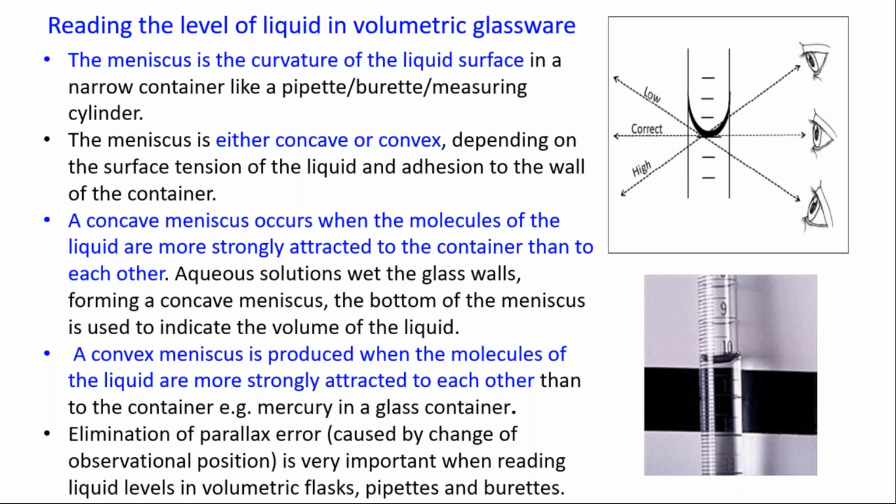Very often when the liquid is there, it is very difficult to look at the meniscus clearly. If you use a black paper behind the burette or the pipette, the meniscus becomes very clear and you can get accurate readings. If you follow all this, you will see that your triplicate readings will almost be identical when you do any titrimetric analysis or volumetric analysis.